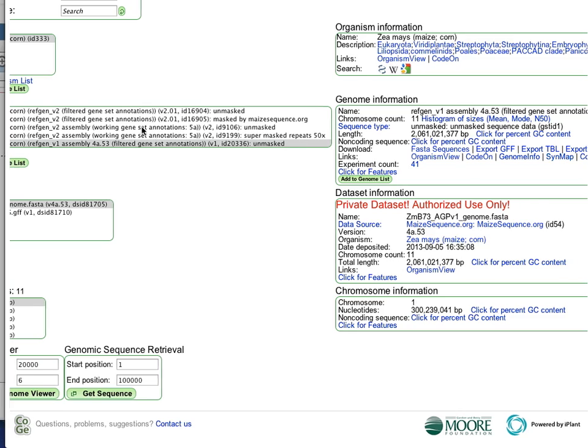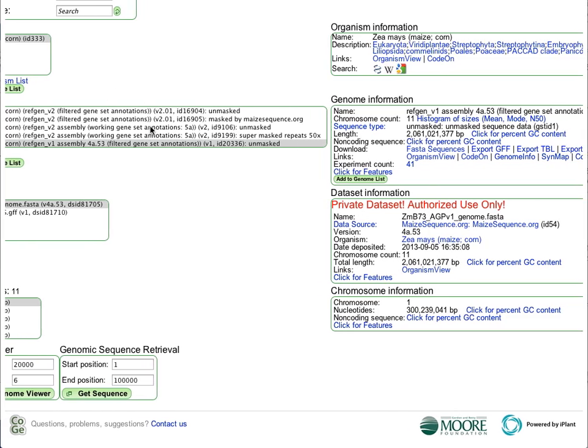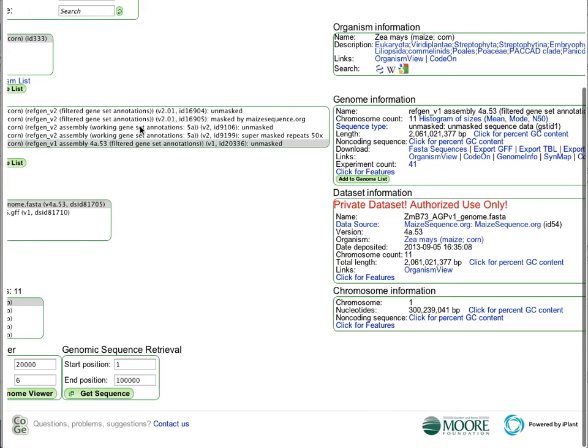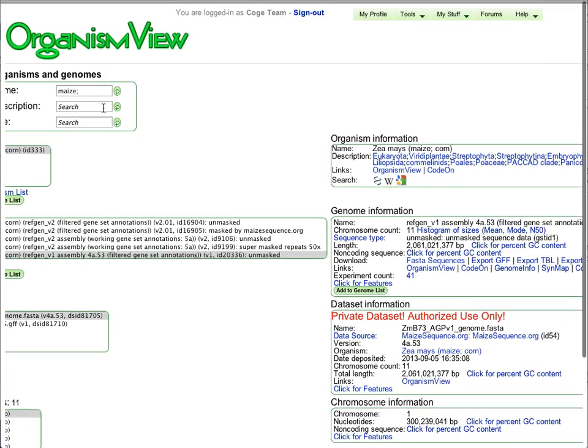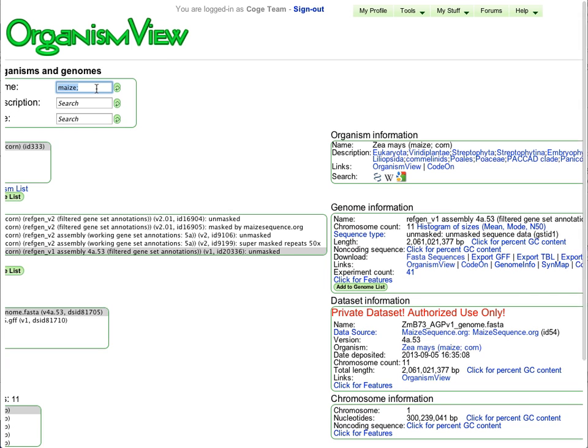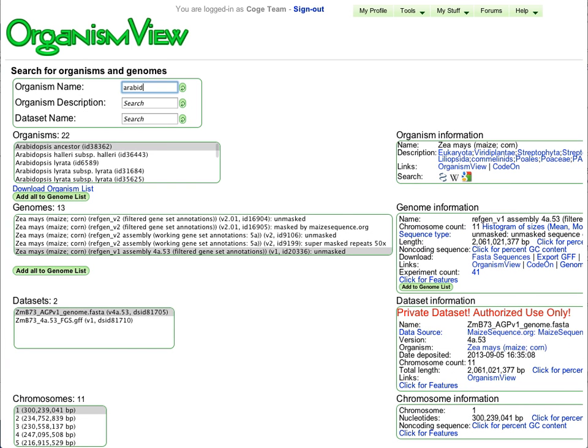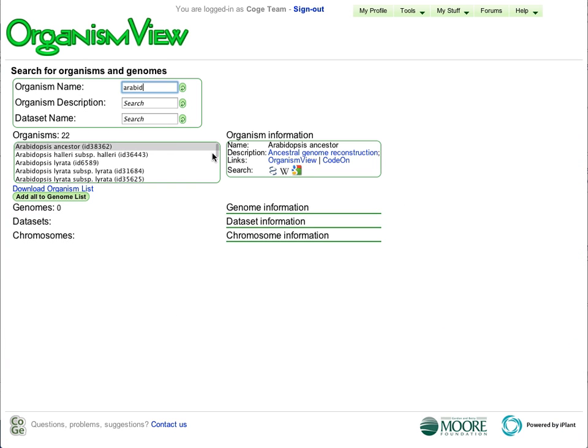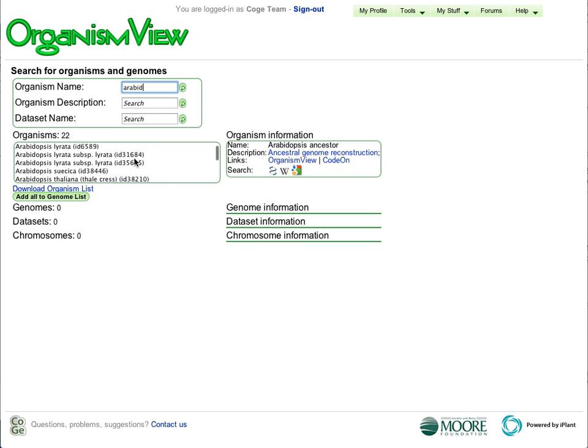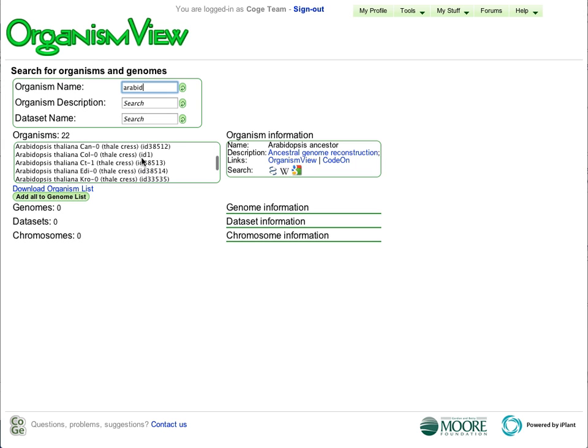I am now going to show CoGe's visualization system for diversity data, and I am going to do this using the organism Arabidopsis, because we have a lot of data loaded for that particular organism. What I want to highlight is that we have many versions of Arabidopsis, including different species and different ecotypes.